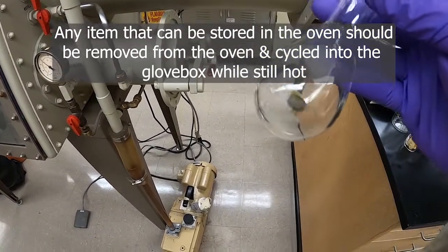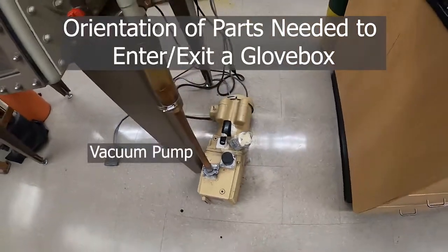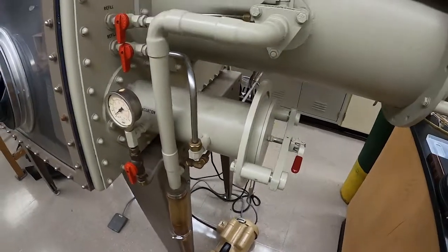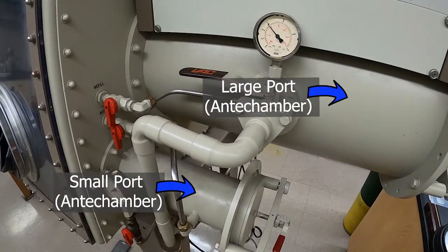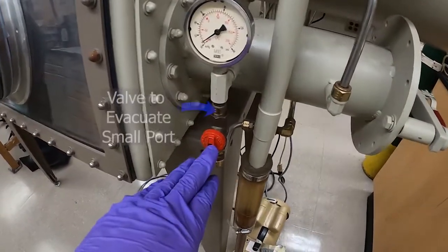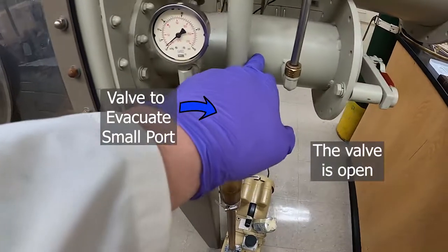Any item that can be heated should be removed from an oven before being brought into the glove box so that we don't bring any water in. Here is the vacuum pump — this is what will be used to evacuate the antechambers, which are here, here, and here. There are the valves for those; this is the valve that evacuates the small antechamber.